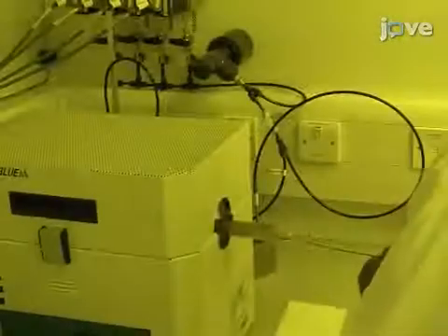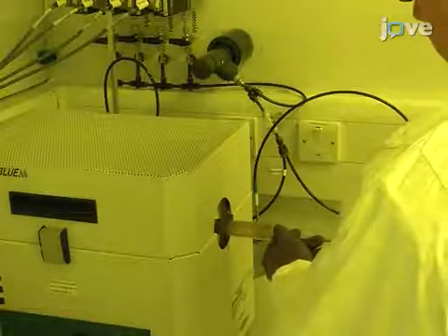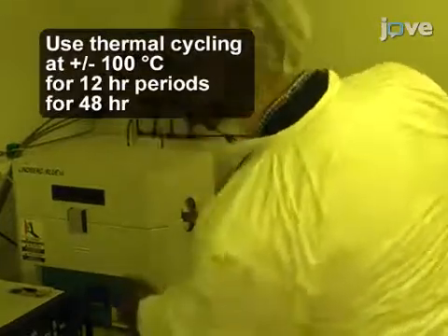Seal the ampoule containing the nanotube mixture under moderate vacuum. In a muffle furnace, heat the sealed ampoule at a ramp rate of approximately 5 degrees Celsius per minute to approximately 100 degrees Celsius greater than the melting point of the filling material.